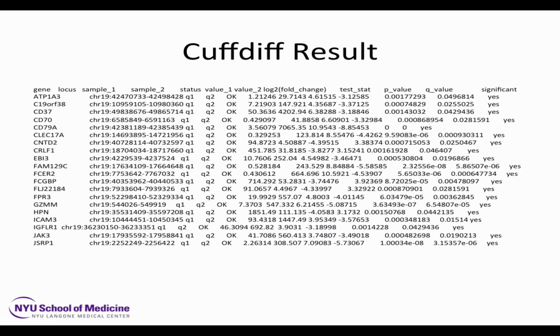If the mapping quality score is too low, meaning it maps to, say, 5 places identically in the genome, then it probably won't pick any of those places, and that read will go into the unmapped bin. You may still get a differential between the different members of the family because some reads probably have differences. There's probably not 100% sequence identity over the entire transcript. There's probably some bases that are different.